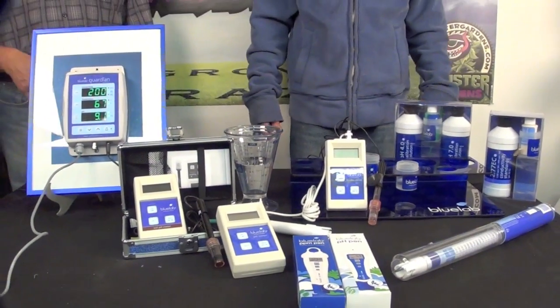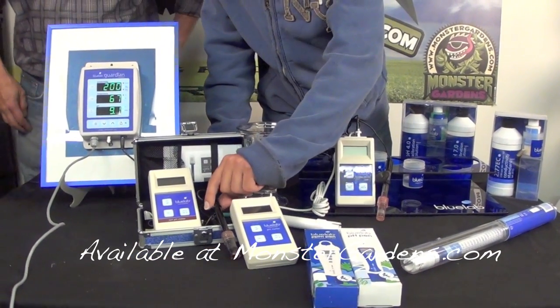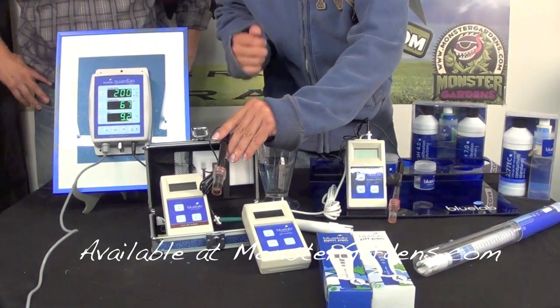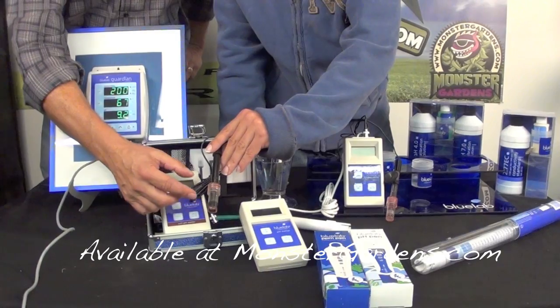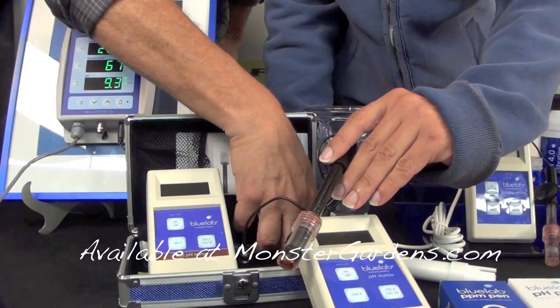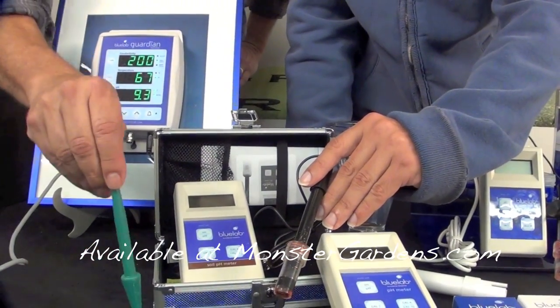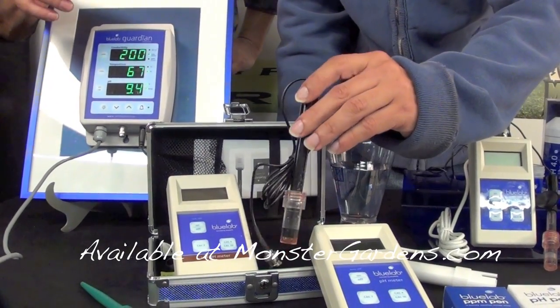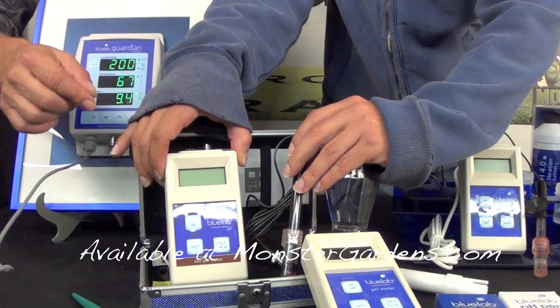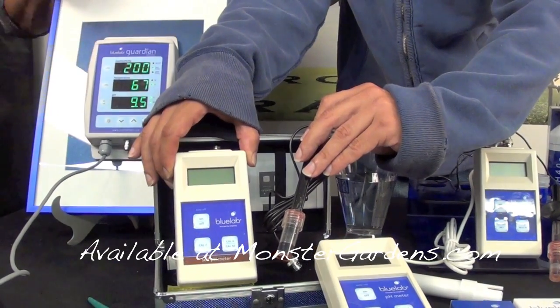We're going to showcase a few other instruments from Blue Lab. This is a soil pH meter. The probe is encased in glass inside the shaft because of the nature of the soil medium. You're going to want to make an indentation in your soil first. Moisten the soil about an hour beforehand with RO water or pure water, stick in the probe, turn the meter on. Of course, you have to calibrate it if it's the first time you've used it.